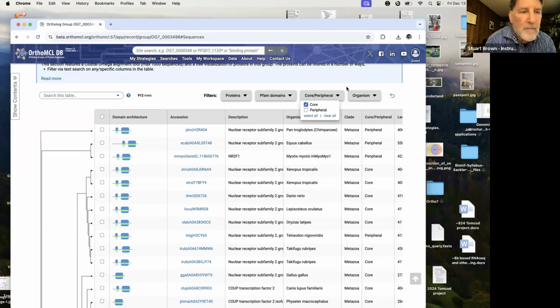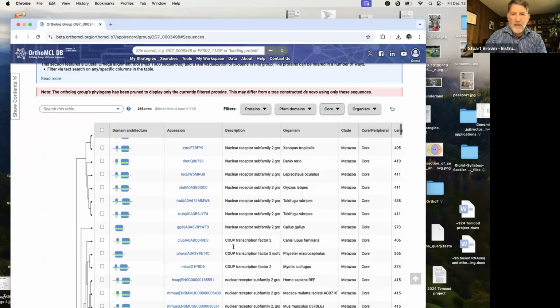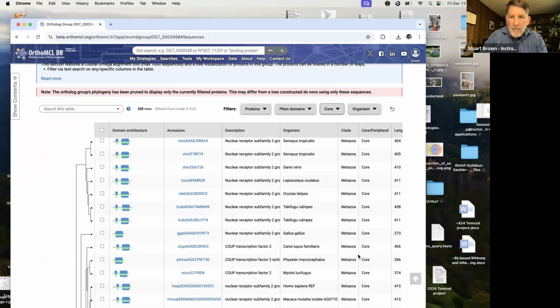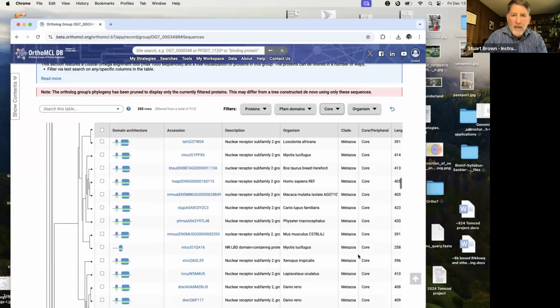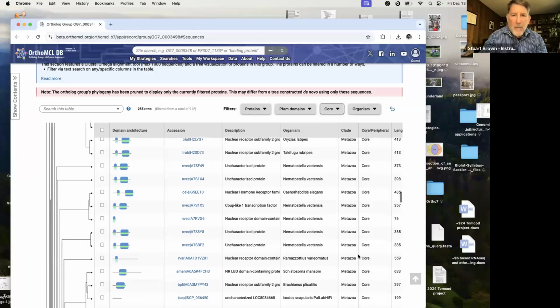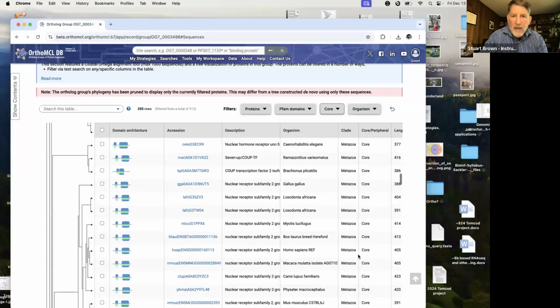With 900 genes in the tree, it takes a moment or so to redraw. And then we throw up this little warning that this is a pruned tree. So now we're not looking at the whole tree, but just at a subset of it. And this works somewhat. It's still a little bit too big to get a solid mental picture of what's going on with this protein family.